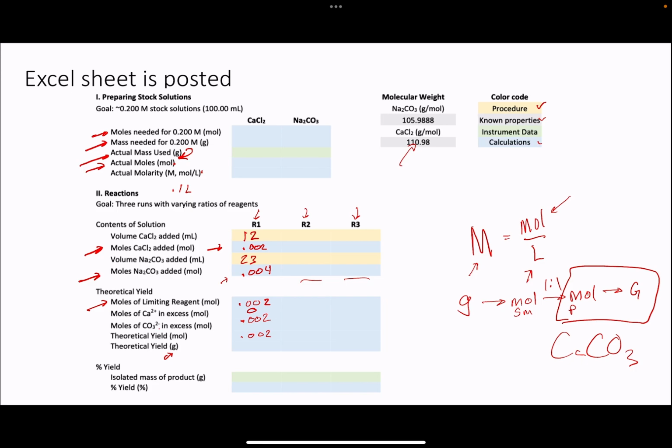Use those masses, but in case you need it, generally online gives you pretty good numbers. But in this case, we want to use 100.0869 grams per mole for our product.